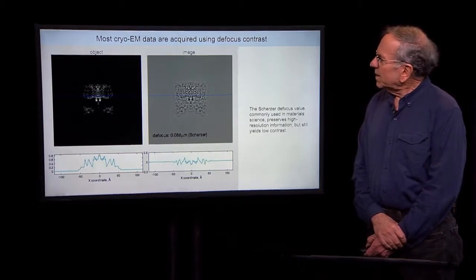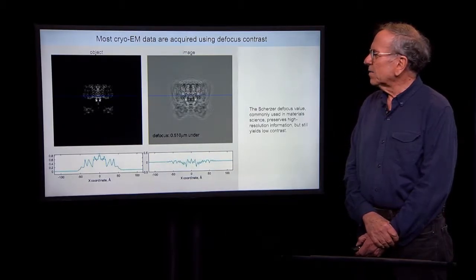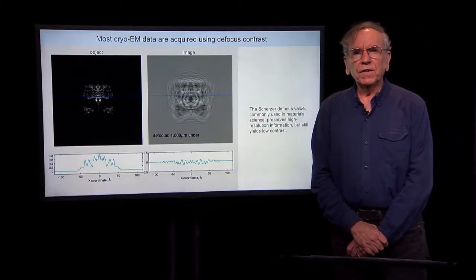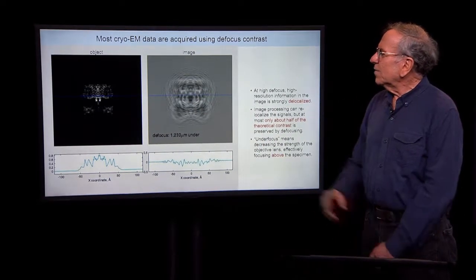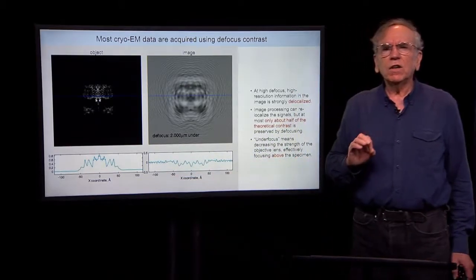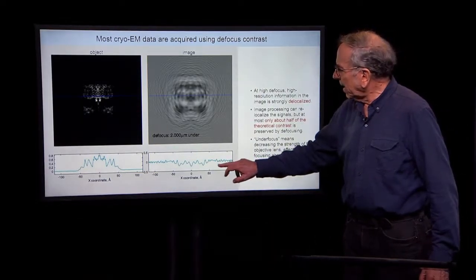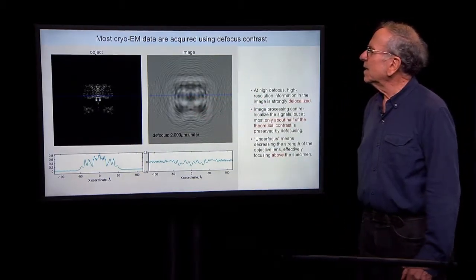So what people in CryoEM do is that they proceed to use even larger amounts of defocus. It's better to do so-called underfocus, which means weakening the objective lens current. And the more underfocus we use, the more contrast we actually get in the acquired image. We can go to even higher defocus values and get more and more contrast, but you can see what's happening here. We're getting what's called image delocalization, whereas the object itself is bounded here within plus and minus 50 angstroms on our x-coordinate, high frequency, high resolution information has been spread out, has been delocalized from the center of our particle.